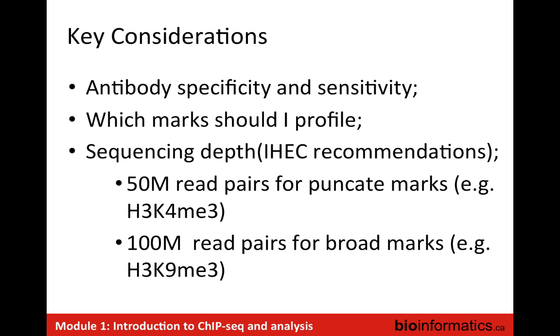And those of you who have worked within transcriptional space, for example, RNA sequencing, you know that's also true. The deeper you sequence, the more complexity emerges. Whether that complexity at the very end of the distribution is relevant biologically, I think is an open question. But it's one to consider when you're planning your experiment.